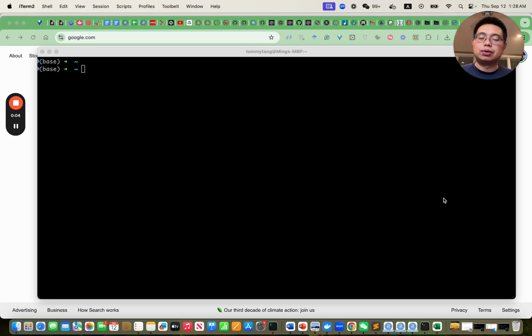In today's video, I'm going to show you how to use Conda to create a new computing environment and install a genomics analysis tool called Bedtools. Bedtools is a very popular tool to analyze the intersection or overlapping of two sets of genomic regions.